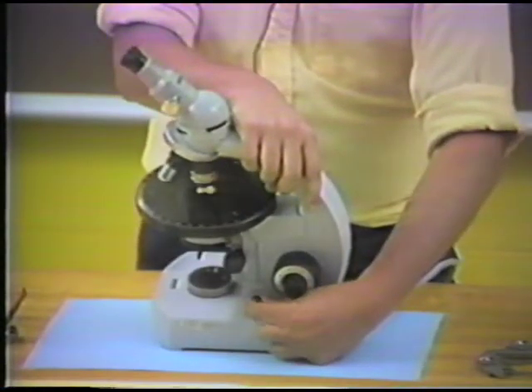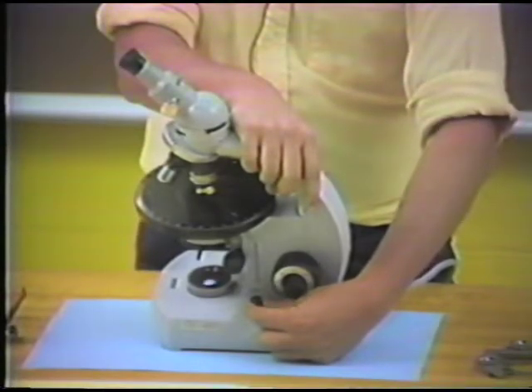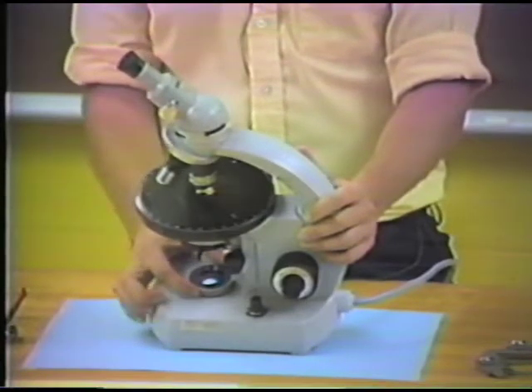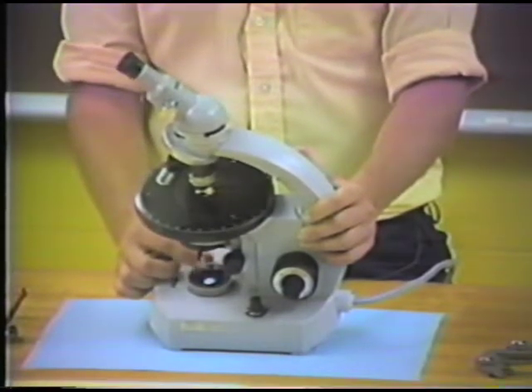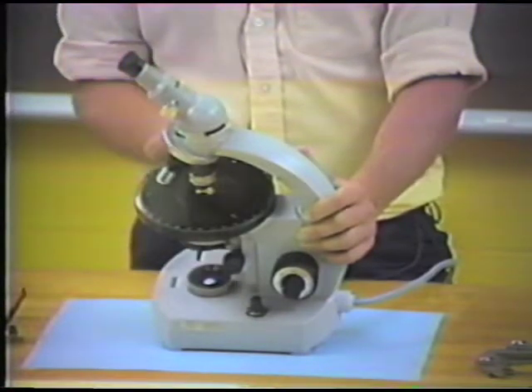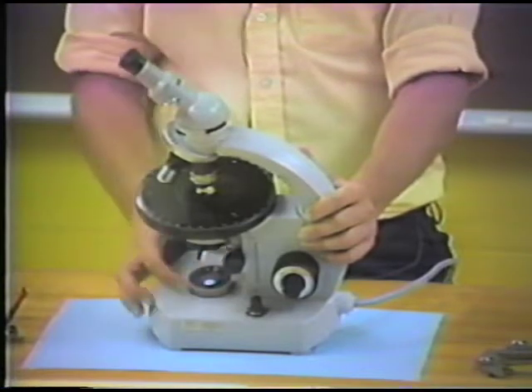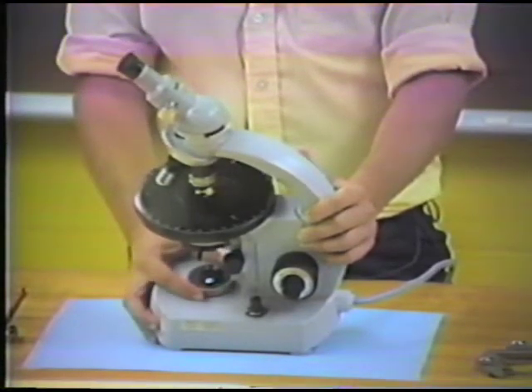Some microscopes actually have mirrors to do this, but as I turn the switch on, you can see the light opening up there, and you can see light emerging in this position. And it goes through this hole and is directed directly upward toward the specimen, and then through the objectives and out the eyepiece.